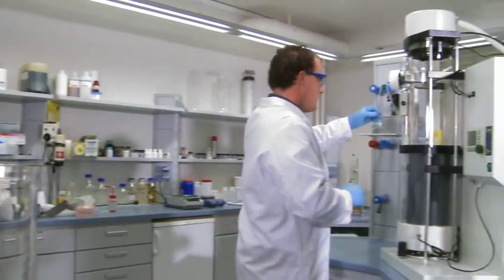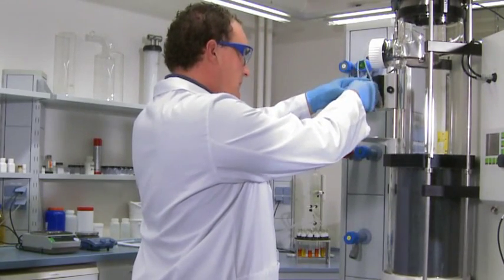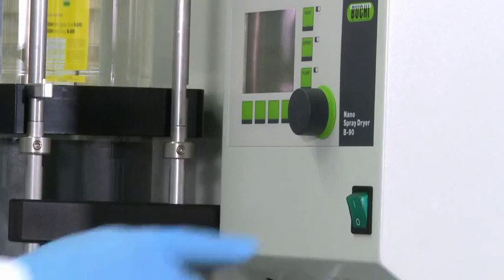Place the sample on the device and insert the feed tubing, one for the inlet and one for the outlet of the sample. Then close the peristaltic pump and turn on the instrument.